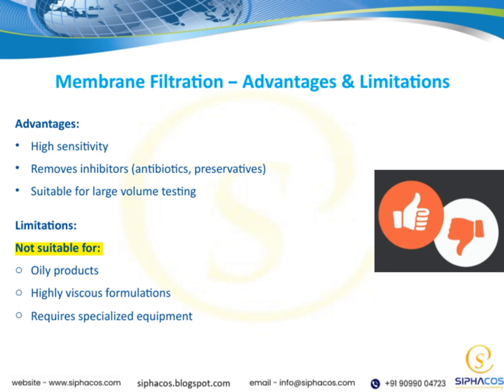This method can detect very low levels of contaminants, which is crucial in many testing scenarios. Additionally, membrane filtration is effective at removing inhibitors such as antibiotics and preservatives, which can interfere with other testing methods. This makes it particularly useful when working with complex samples. It's also well-suited for testing large volumes, allowing us to process more sample material efficiently.